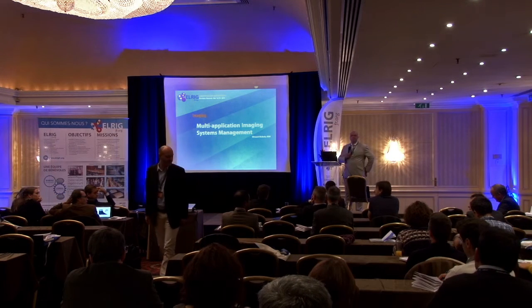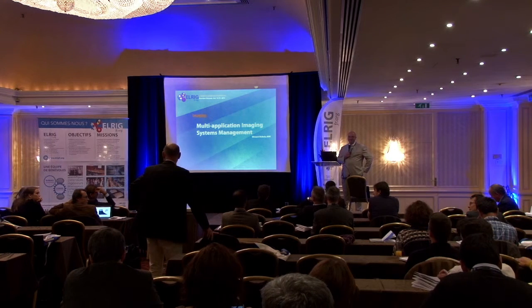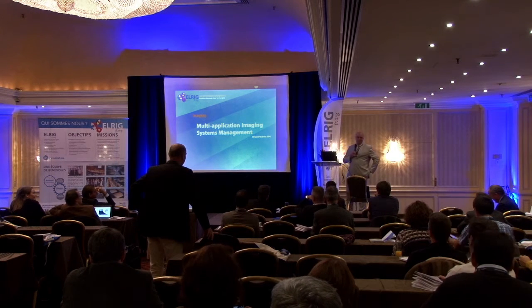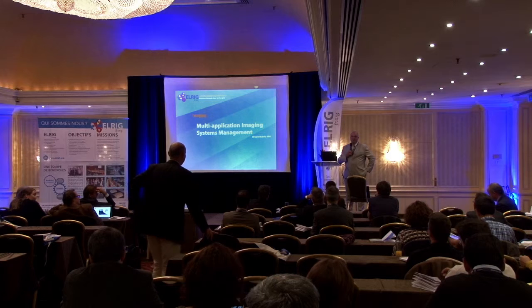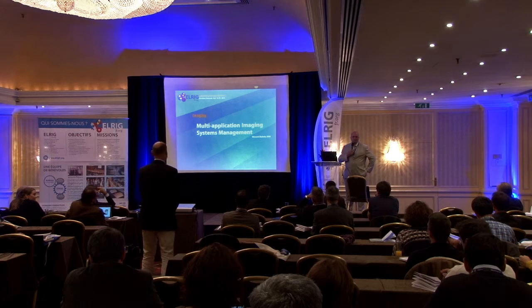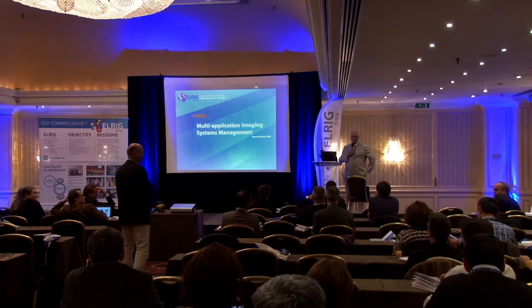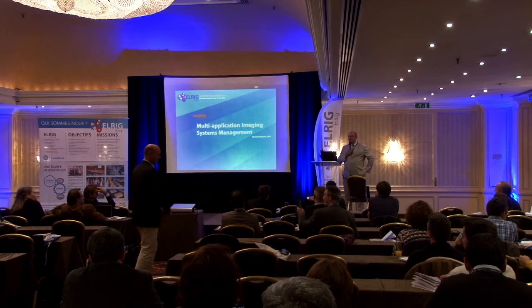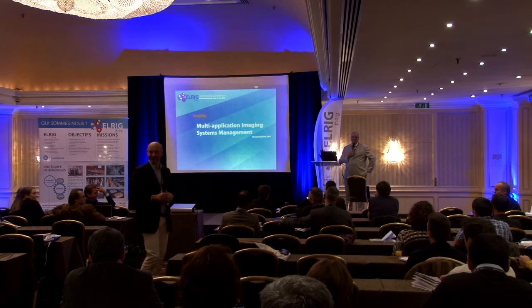Just a simple, practical question. You talk about millions of pictures. Do you keep them for a limited period of time, or do you store them? Because we are in a pharmaceutical environment, we have to follow a global retention policy. When you are in QC, it could be only 5 years, if I remember well, but it could be 65 years at the maximum. Okay. Do you compress them, or how many terabytes do you need? Just to give you an idea, it's between 10 and 50 terabytes of data a year.